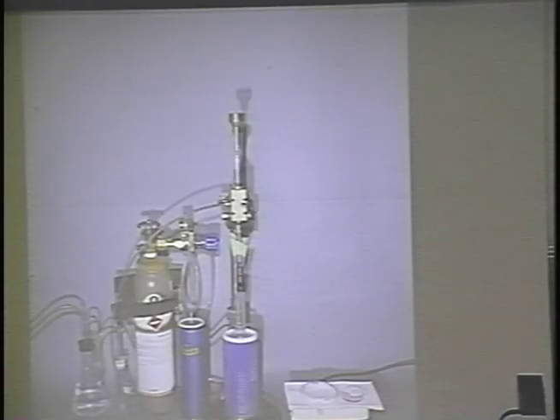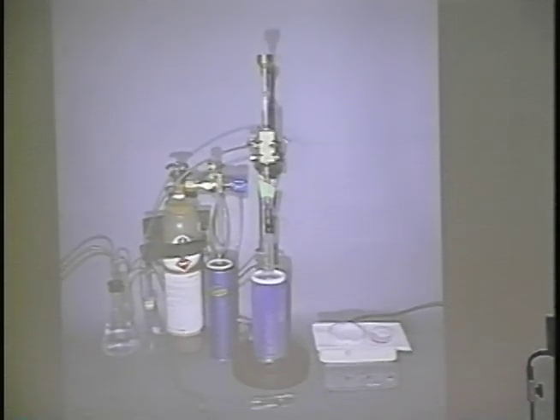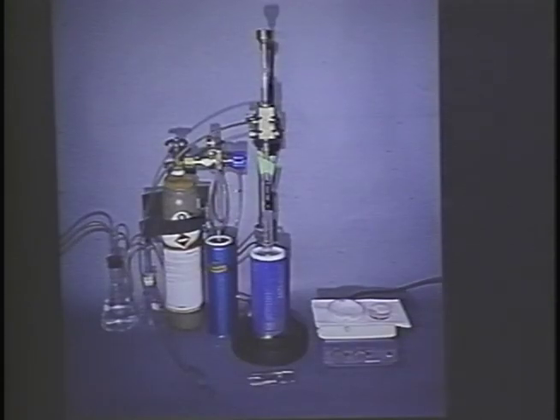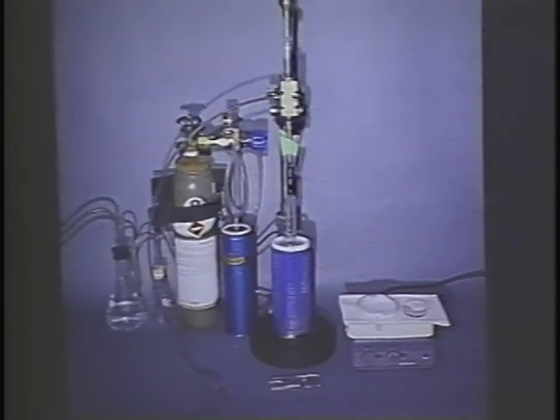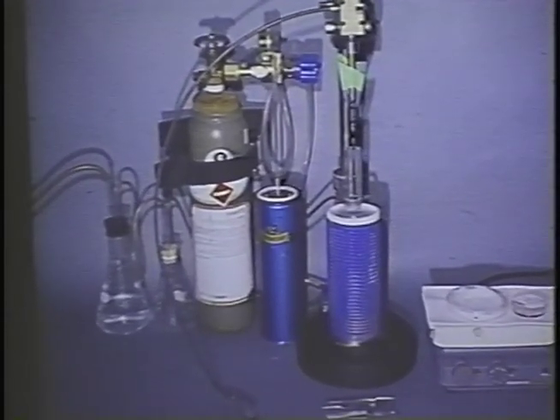This is an overview of the freezing apparatus that I use. It's a plunge freezer that is modeled after a design by Dr. John Murray at the University of Pennsylvania. It consists of a vertical slide rail that guides the fall of a mounted pair of forceps that clamp the specimen. The forceps are surrounded by a plexiglass humidity chamber in which cold, humid air is continually pumped in to prevent drying of the sample before freezing. Next slide.